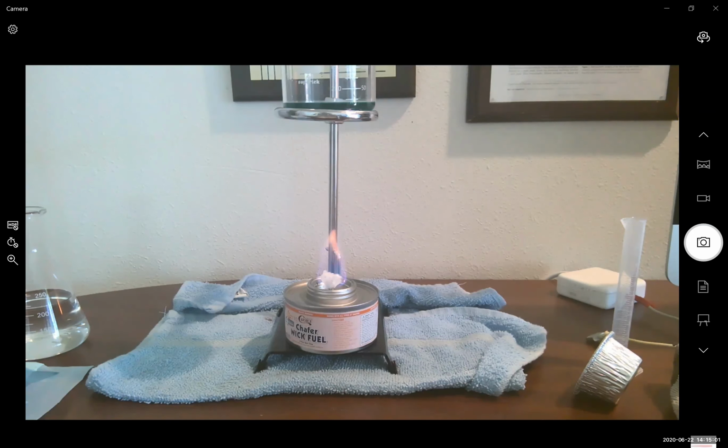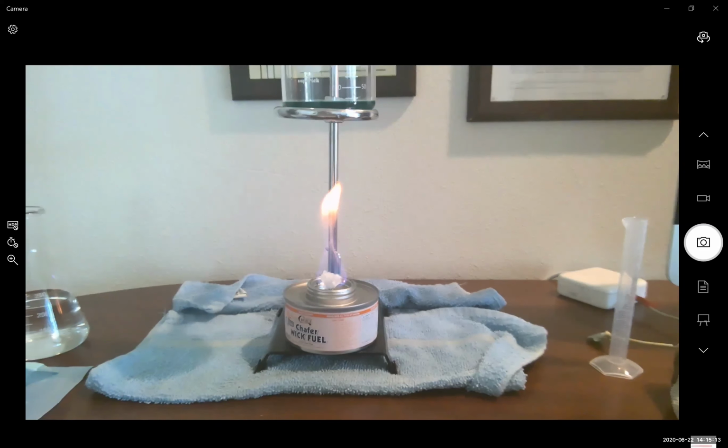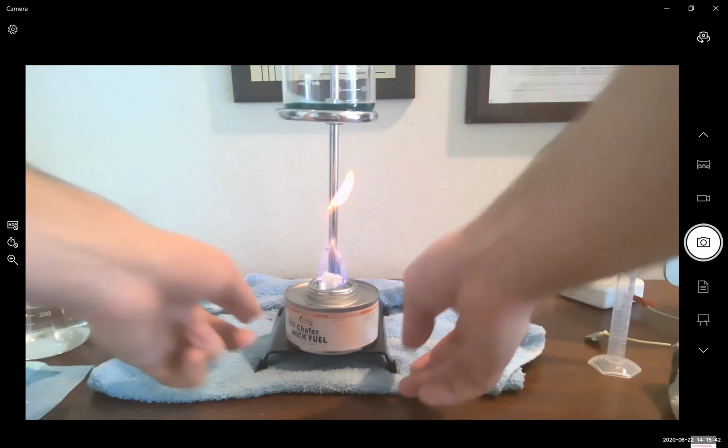Now we're going to place our aluminum washers. The aluminum washers that we carefully set aside in our container, we are going to place them carefully into our beaker. So we're going to drop them into our beaker. Okay, this will initiate a chemical reaction in which the copper will be reduced to copper 0 and the aluminum will be oxidized.